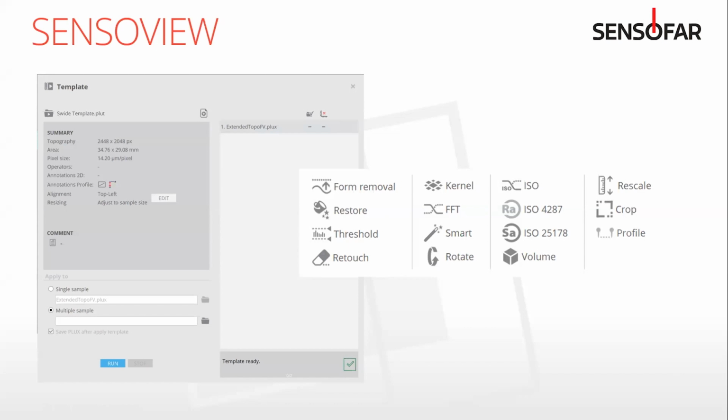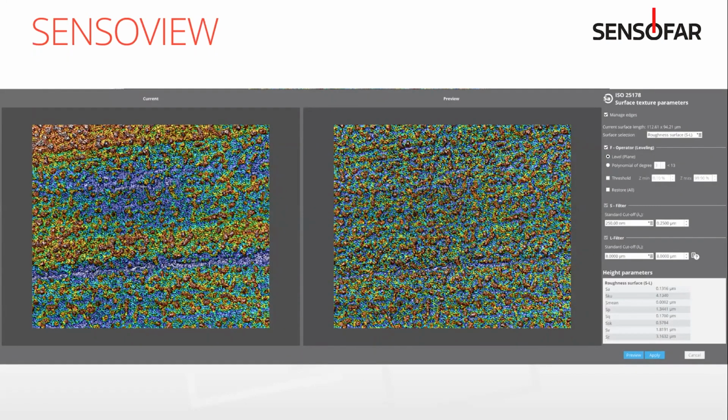So I'll briefly go over what that might look like. This is what we call our easy or smart roughness analysis button. So you give it the acquisition that you've got, and you hit the button, and based on your expected roughness and your evaluation length, the software is going to pick what cutoff values it thinks will give you the most accurate surface roughness, kurtosis, mean, peak height, or whatever parameter you're looking for. And that can obviously be saved and then repeatedly done every time you take a scan without you having to apply that again and again.